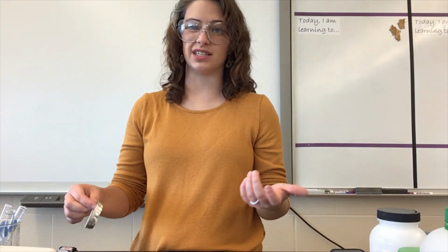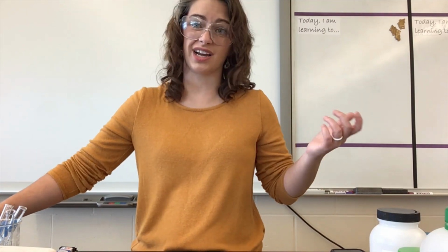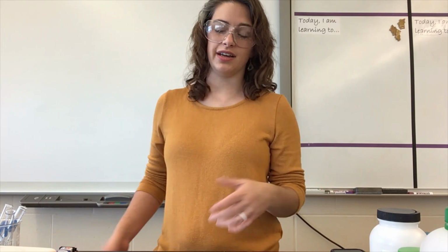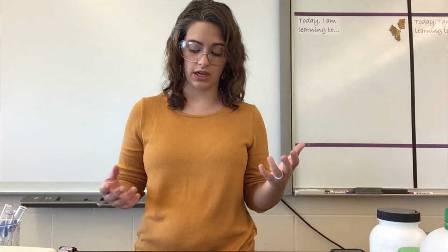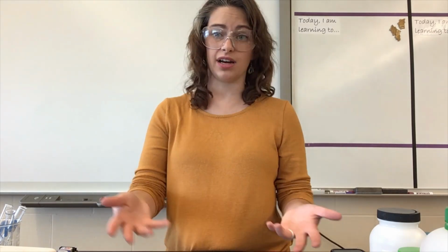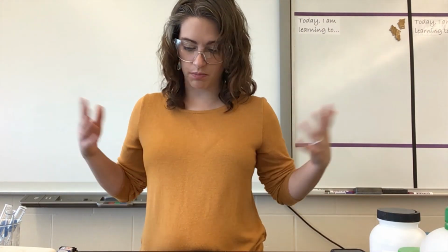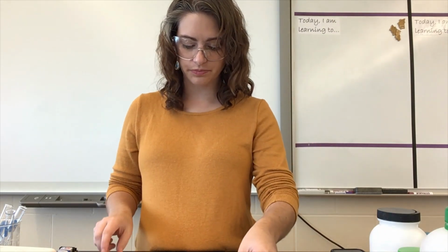And actually this one's weird because there isn't really a solution because it didn't dissolve. So actually we don't need to test it in solution because the solution doesn't exist. In order for a solution to be a solution, the thing had to have dissolved in it. So it's not there. It's just the solid floating in water. So it's not going to conduct because we already know that the solid doesn't conduct. So we can skip that one. We can put an X in it because we can't test the solution if we don't have a solution.